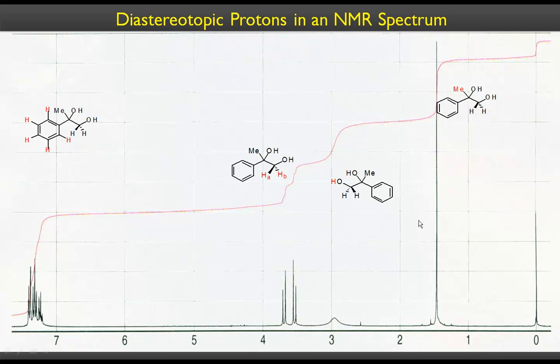So that should tell you something about the substitution pattern of the aromatic. The moment you have 5 hydrogens here, integrating in the ratio as is seen here, you should think of monosubstituted, right? Anyhow, the discussion should be here, though. The focus should be here.